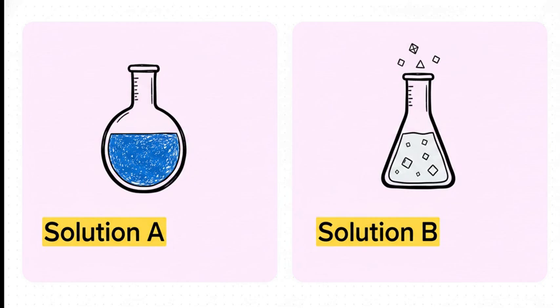Now, why do we even need solution B? Well, without it, the really strong alkaline environment would instantly cause those copper ions to just clump up as a totally useless hydroxide, dropping right to the bottom of the flask before the sugar even shows up. So the tartrate acts as a chelating agent. It gently holds the copper ions in solution, keeping them perfectly stable and suspended until the exact moment our reducing sugar is introduced.